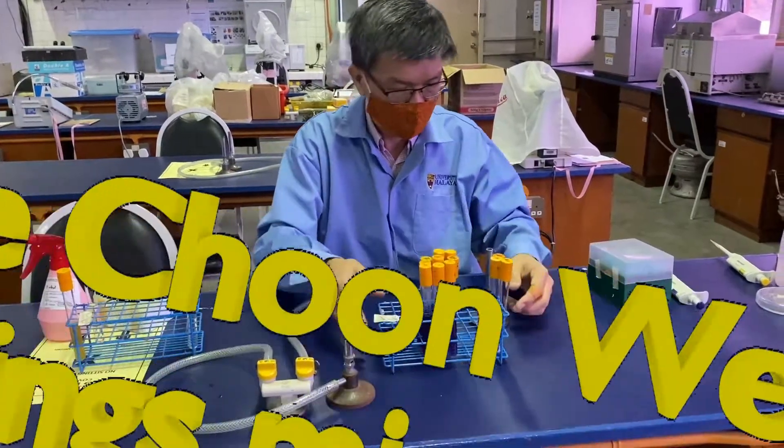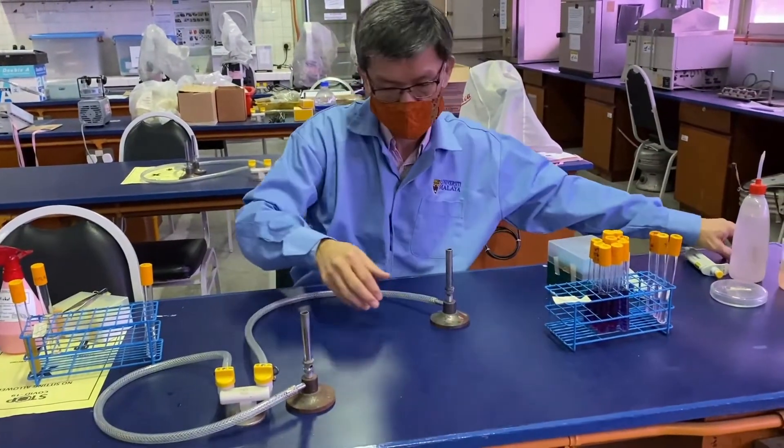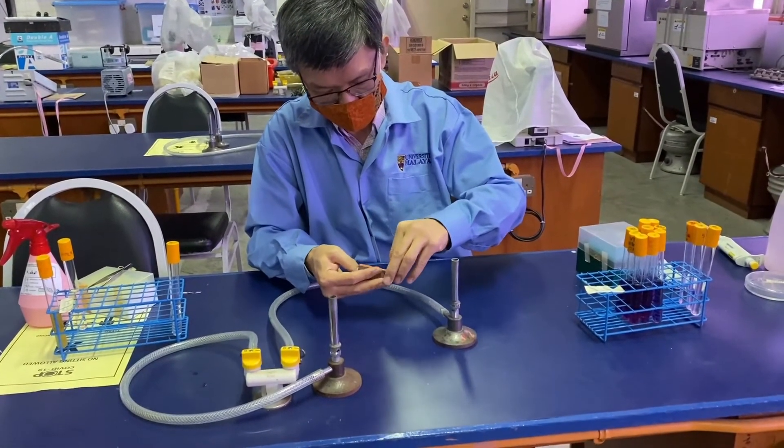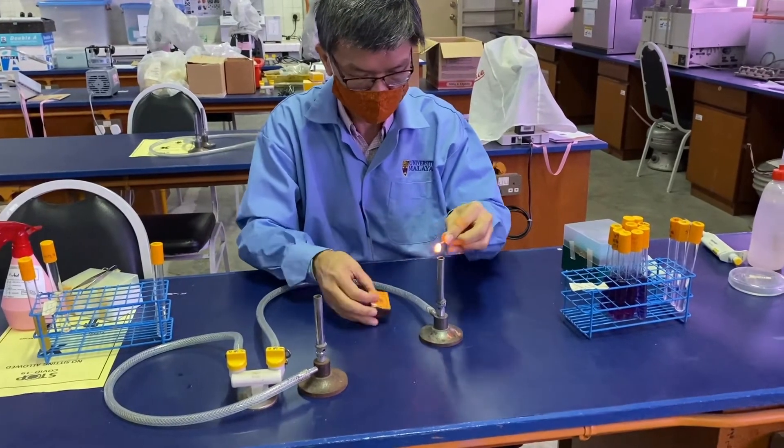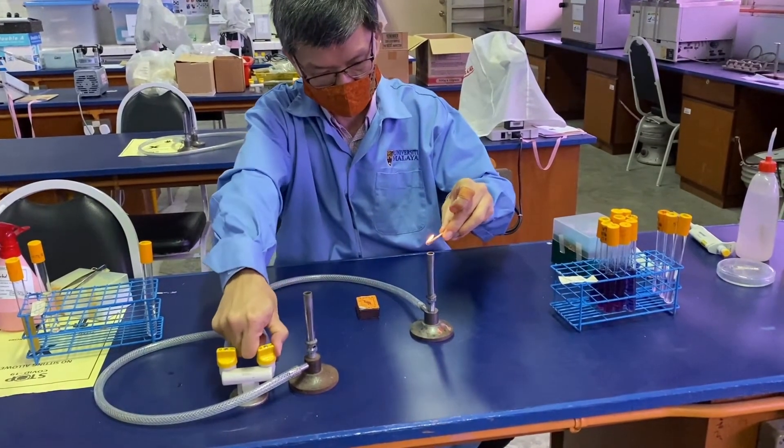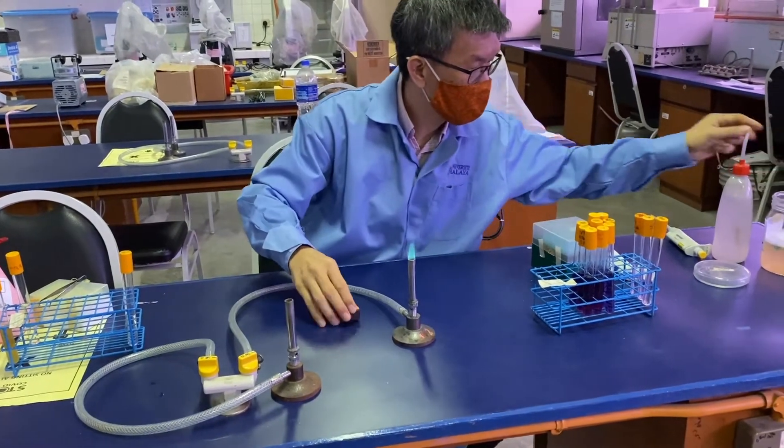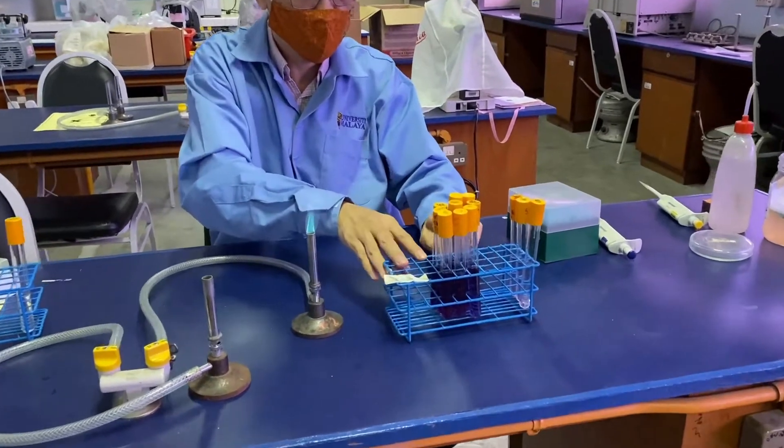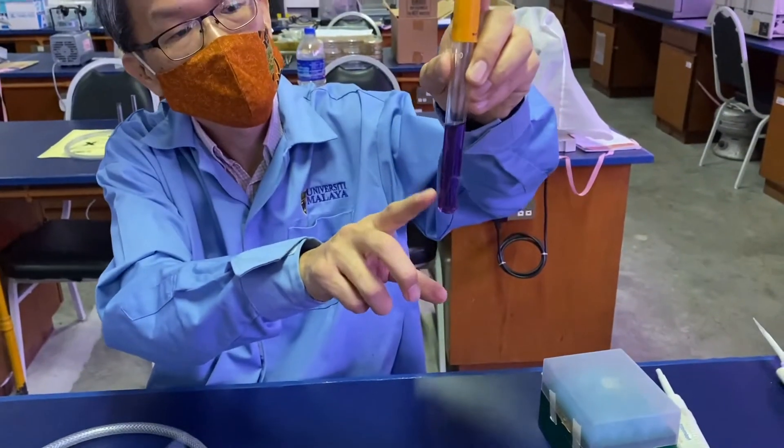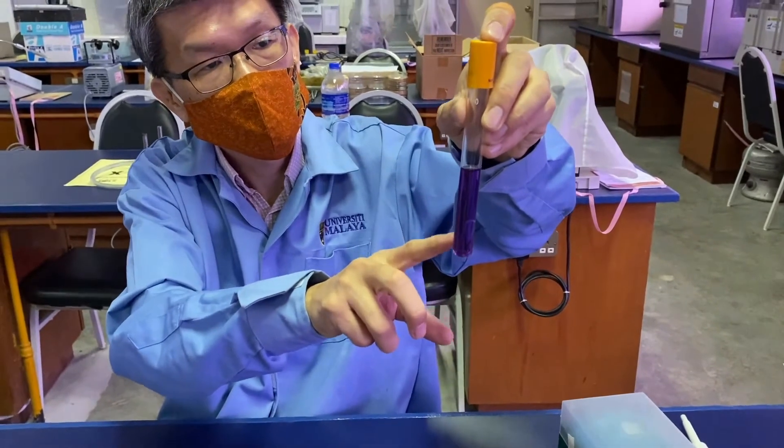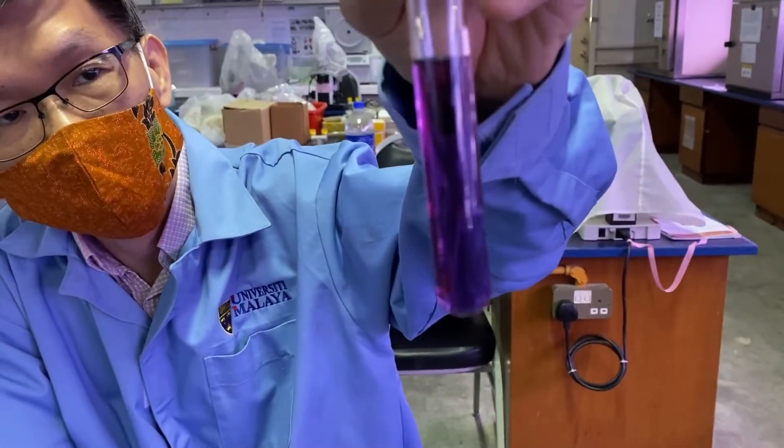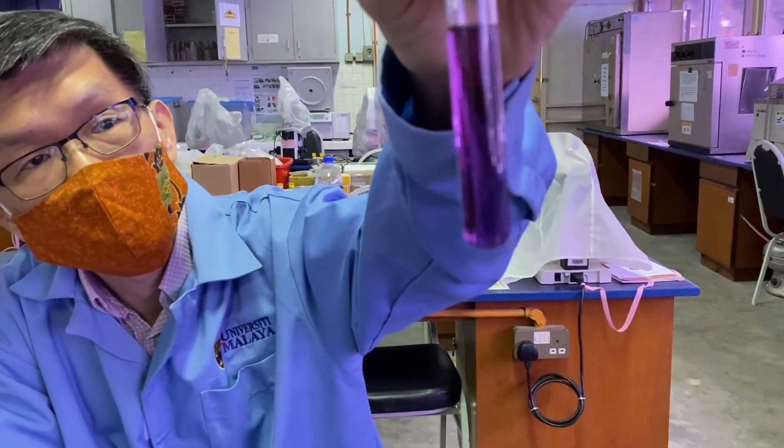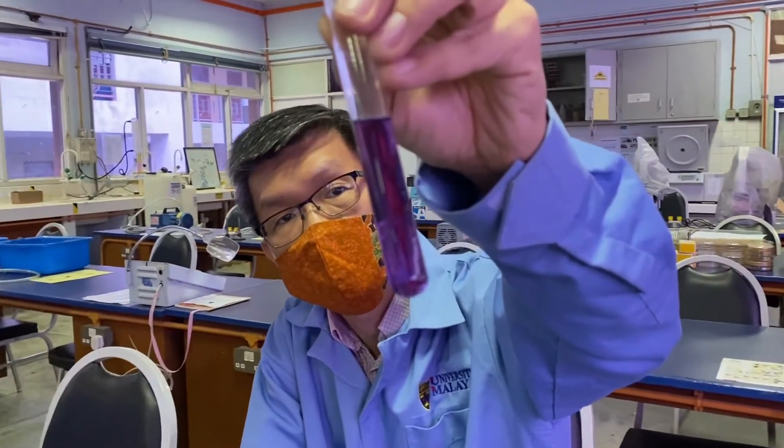This is how we prepare the Most Probable Number technique. We have to work around the flame to ensure aseptic conditions. We are working with McConkey purple broth with a Durham tube inside, and we are preparing a three-tube MPN.